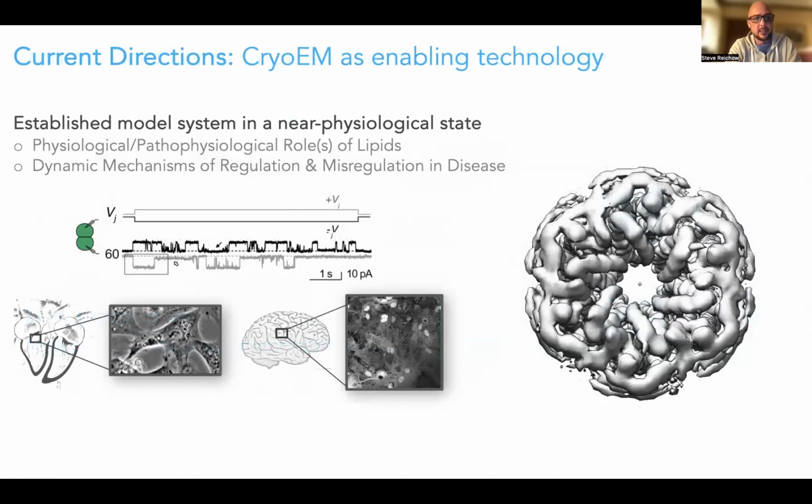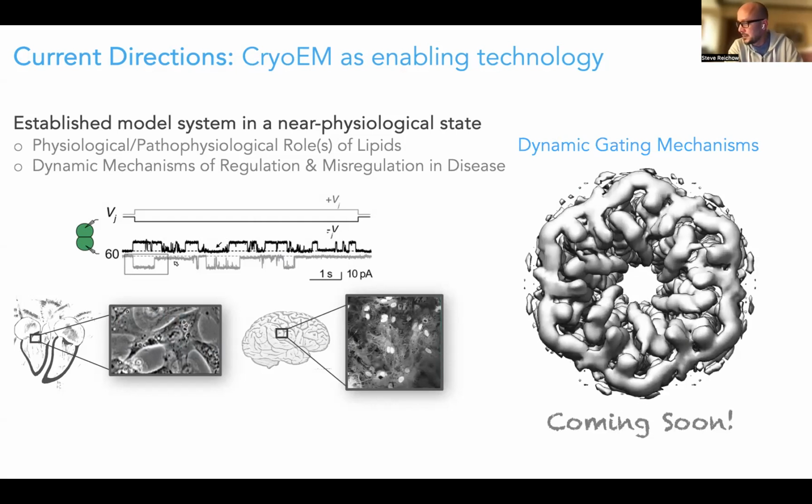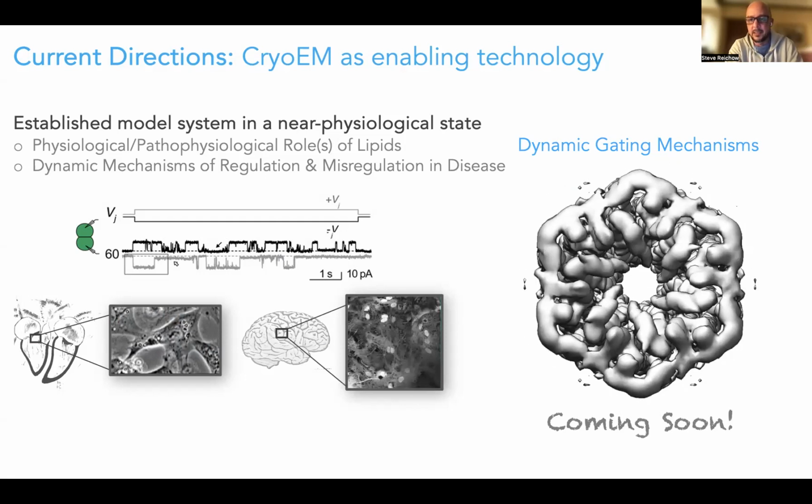Coming to the end of the talk, I just want to give you a little bit of a glimpse into where this work is heading. I told you about our interest in understanding the functional role of lipids and probing those by cryo-EM. I want to remind us that these channels are dynamically regulated by the cell in response to many different physiological processes. These gating events are highly dynamic and sample many different conductance and subconductance states. Using cryo-EM, we're starting to resolve some of these dynamic gating features. We don't have the details worked out to the level that I'm comfortable going into in this talk, but those details should be coming out hopefully very soon. And I think we're getting a lot of new insights to gain from these channels using cryo-EM.